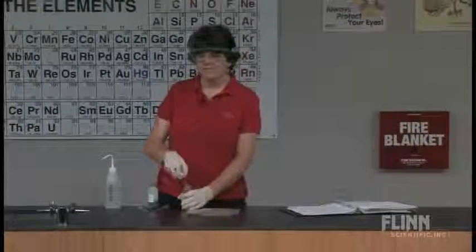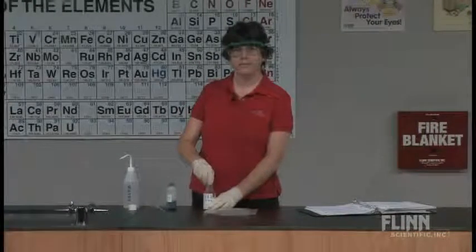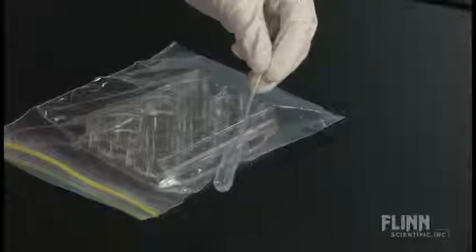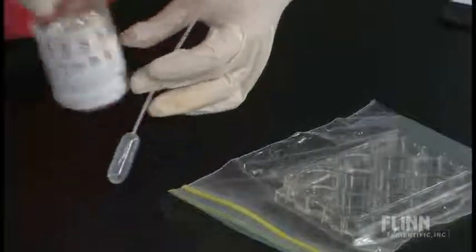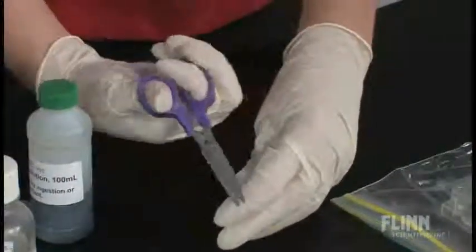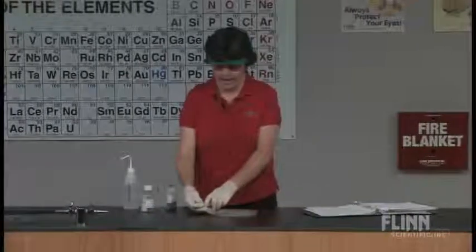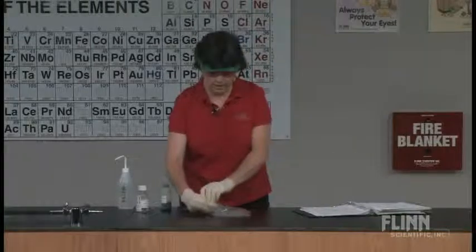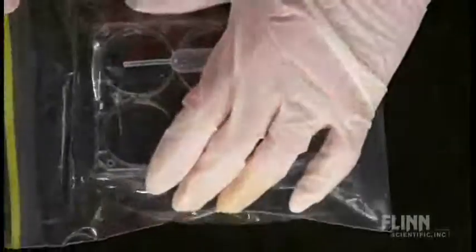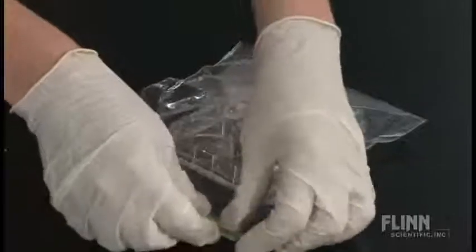This is the hard part if you're not well coordinated. I want to put some acid into the well with the copper at the same time that I want to close the baggie. After I've got the acid in there, I cut that — be careful because the tip still has some acid in it. I don't want the reaction to start until after the baggie is closed. With these large well plates, I try to get the air out without squeezing the pipette. Coordination becomes more difficult with gloves on, but it's worth it.